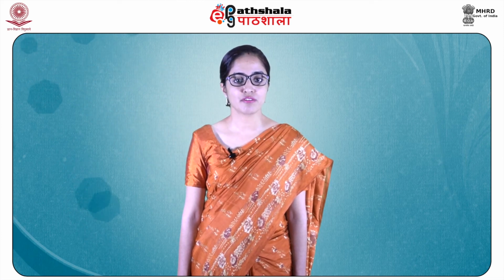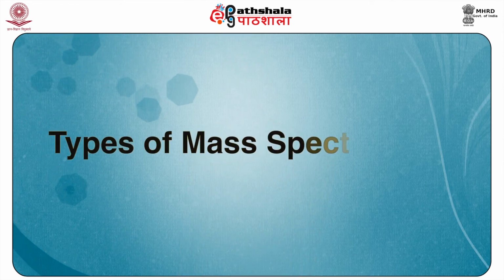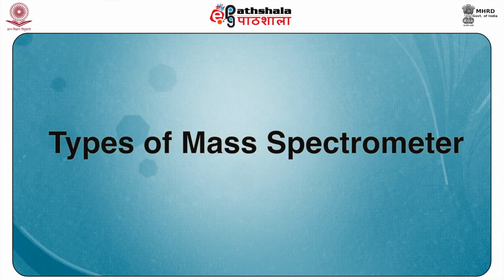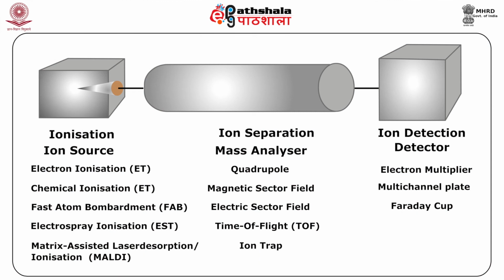Now, students, let us go on to the combined study of detectors, analyzers and ionization methods and see how they make up different types of mass spectrometer instruments as a whole. Depending on the methods of ionization, ion separation and detection described in detail above, there are various types of mass spectrometers which are shown. According to the ionization technique, there can be electron impact ionization, electrospray ionization, chemical ionization, SIMS, MALDI, FAB, etc.